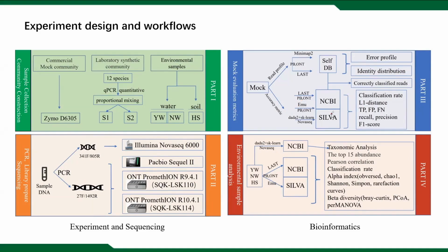For mock samples, we focus on the error profiles, the proportion of correctly classified reads, L1 distance, true positive taxa, false positive taxa, precision, recall, and F1 scores.